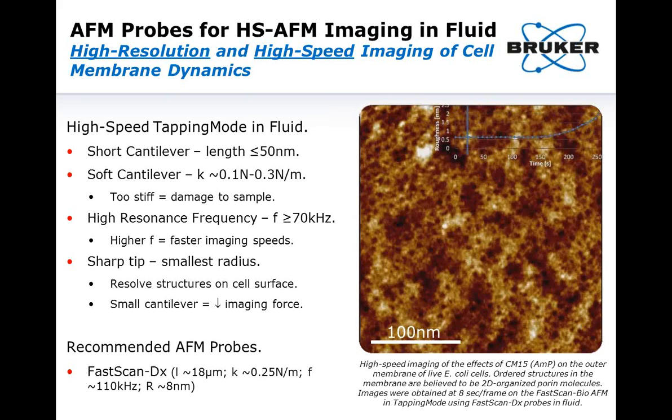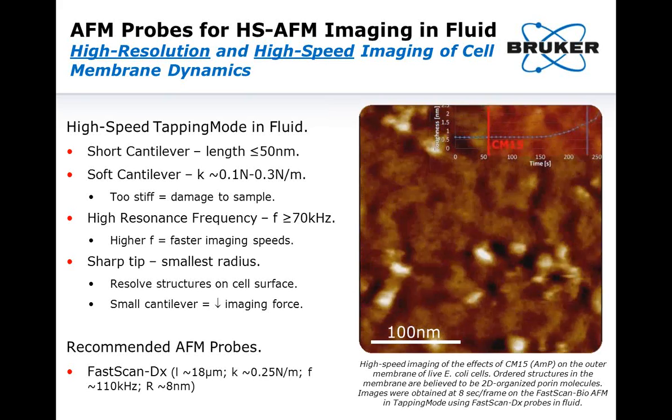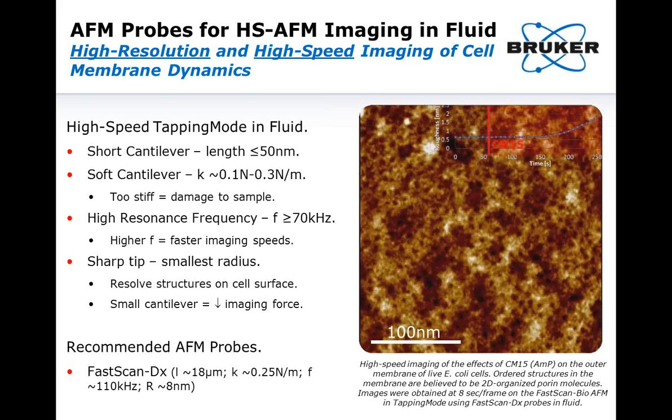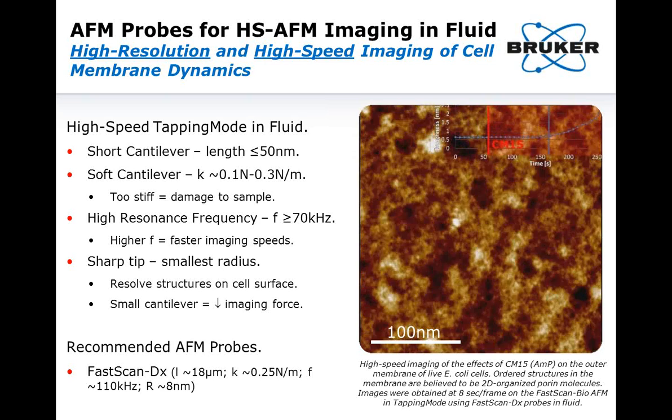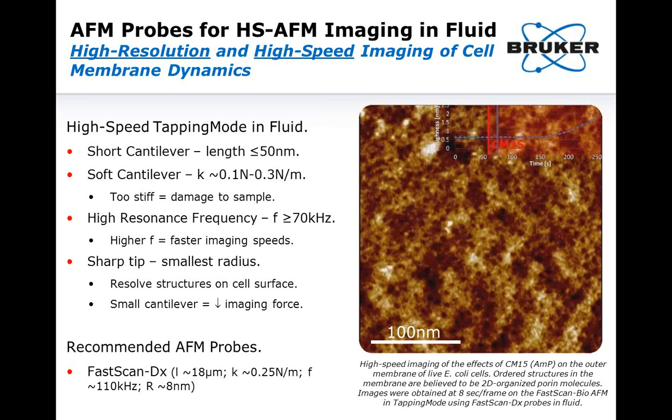As this image is acquired in tapping mode, we again need to have a probe that is stiff enough to be able to oscillate in fluid, but is not so stiff as to damage the sample. Again here, the probe that we've decided to use is the Fast Scan DX probe.